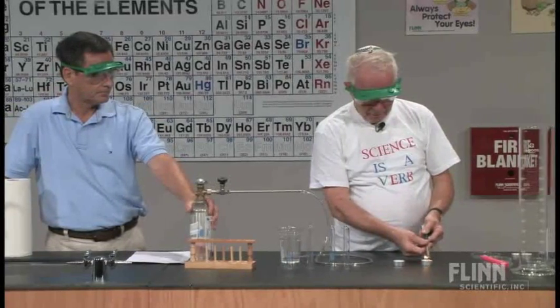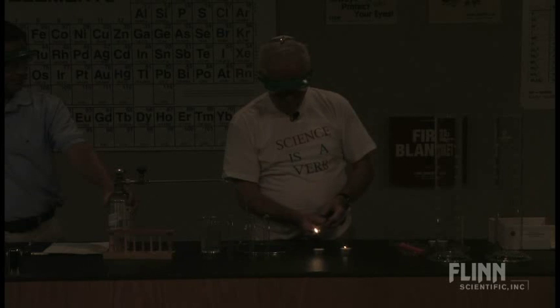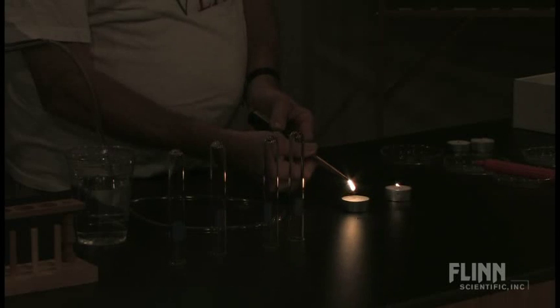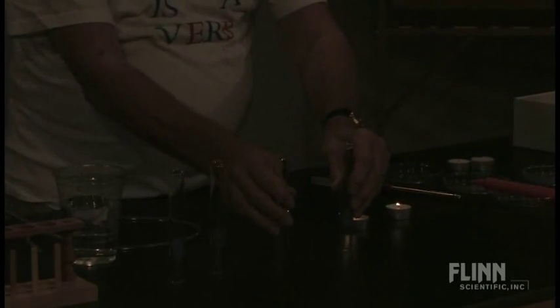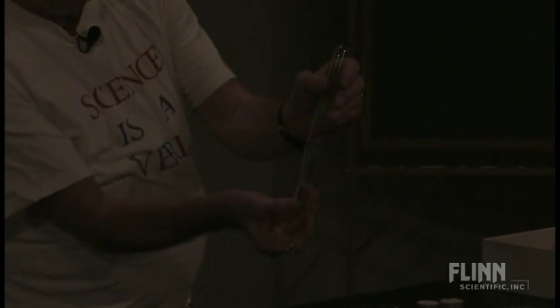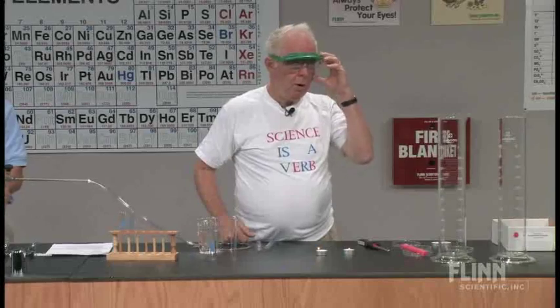If you dim the lights please. Now I'm going to do this very quickly so you have to watch carefully. You observed that I lit one tube and used the first tube to ignite the second.